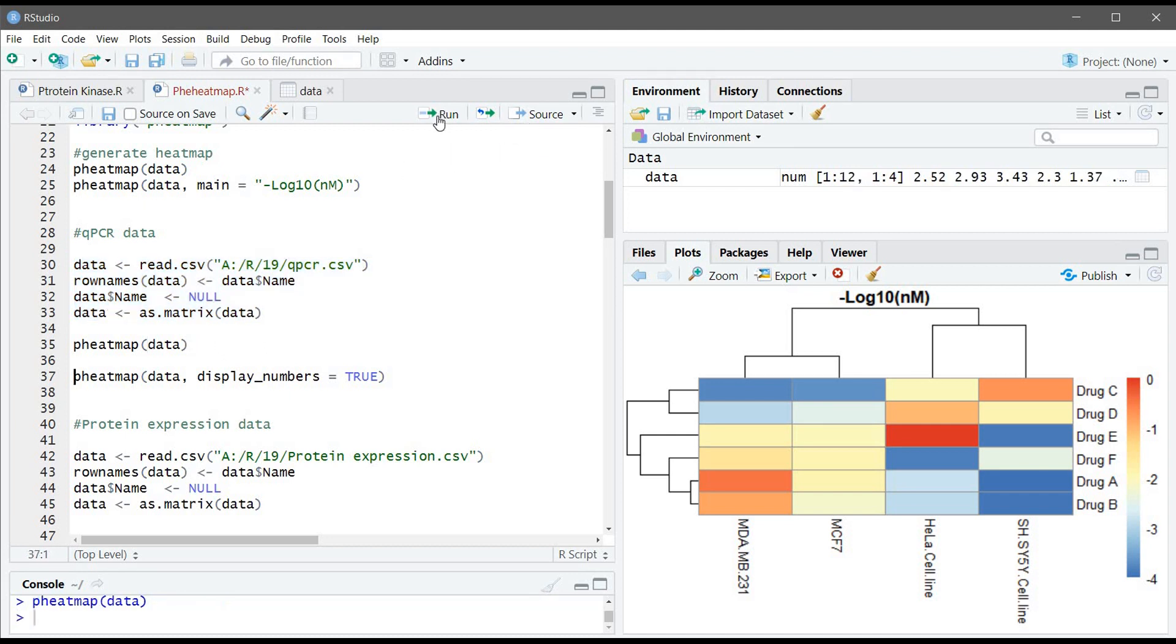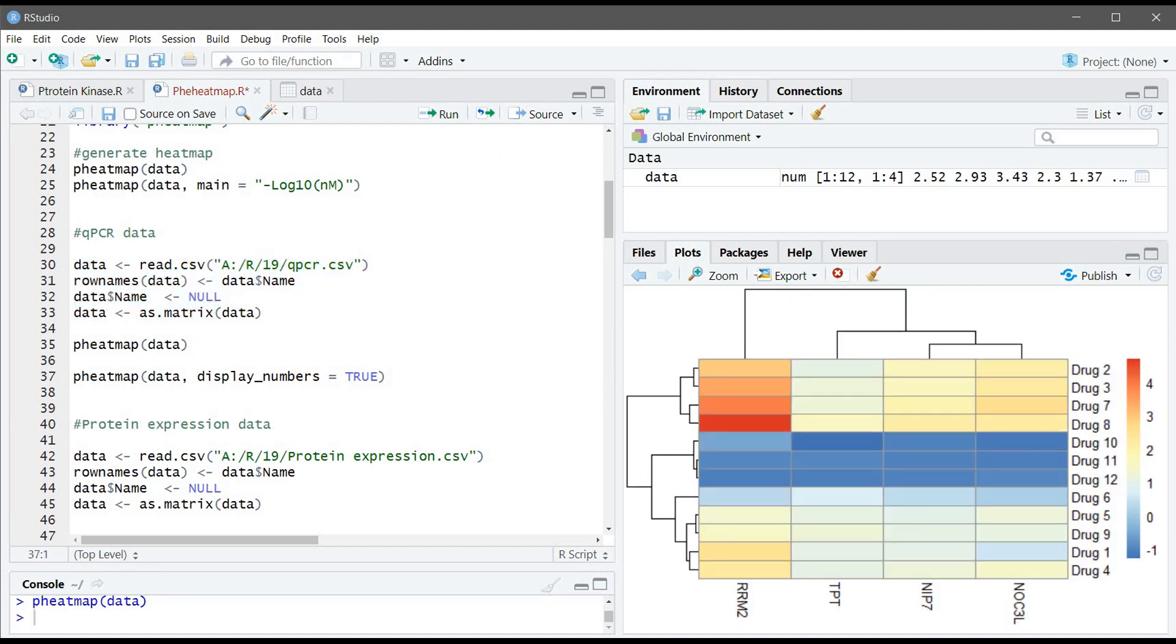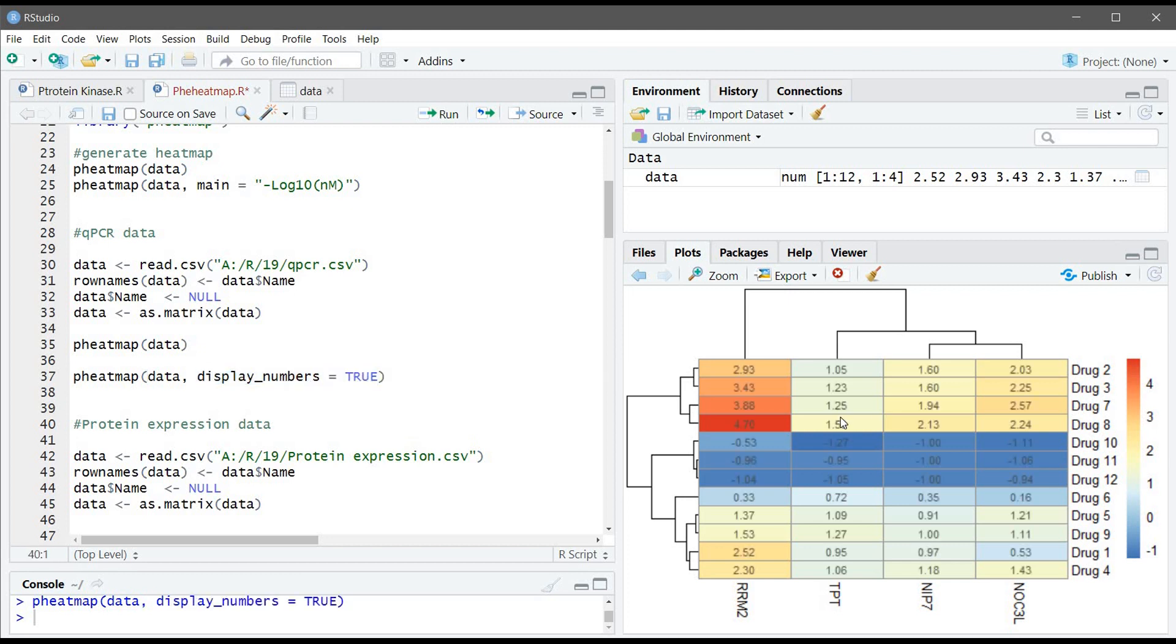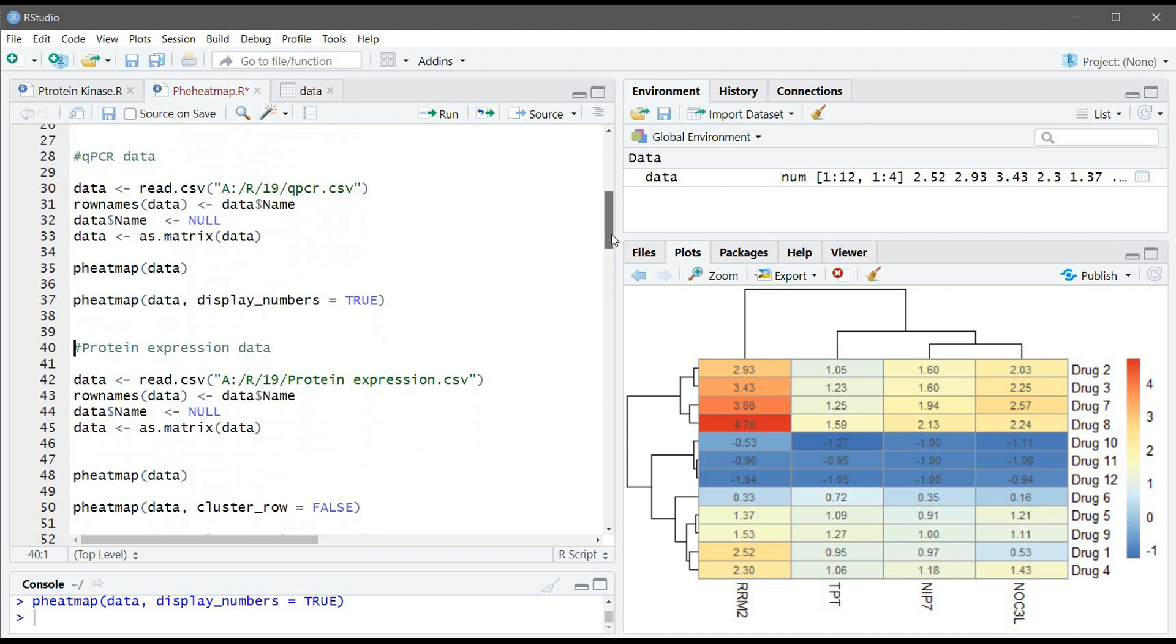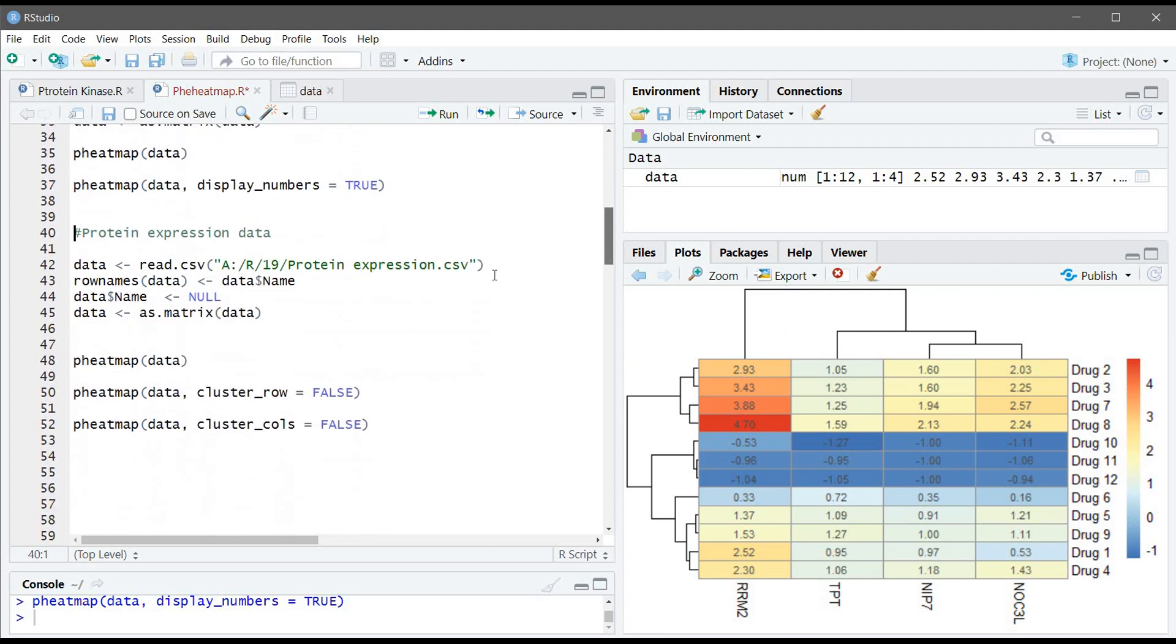It's very important also to see the actual numbers. So we can use the display_number argument equal TRUE so we can see the actual upregulation, how many times they are upregulated compared to the control and how many times they are downregulated.